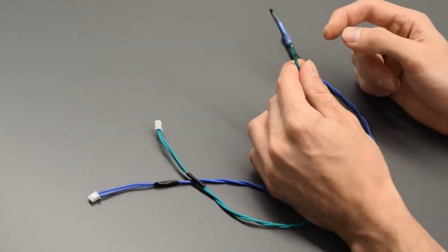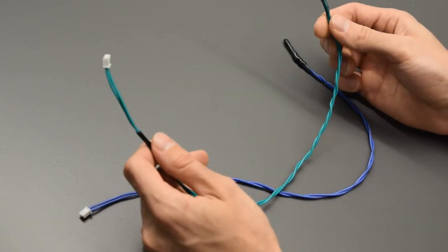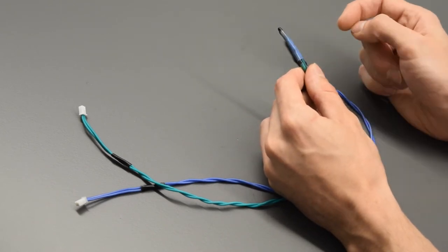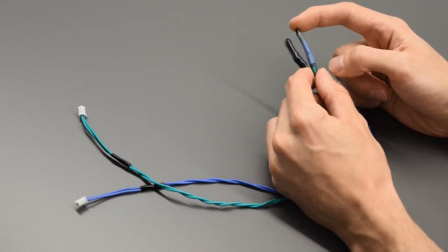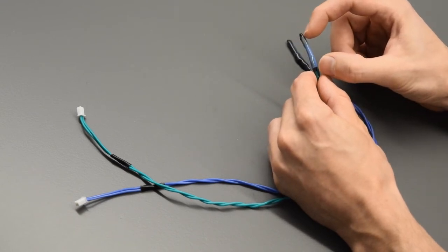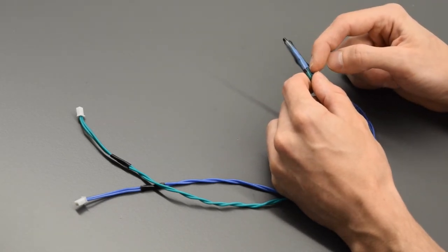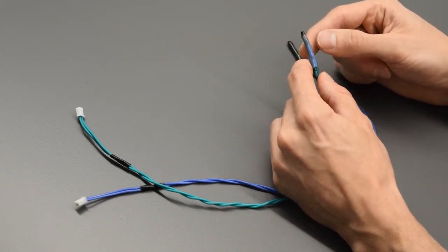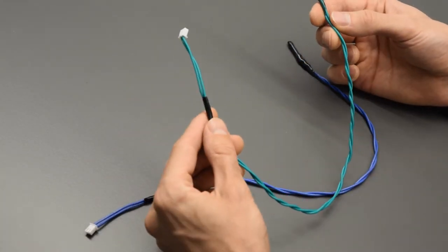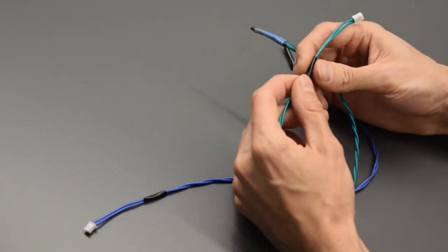So I took my thermistor, 2 wires, approximately 18 inches, and stripped the wires a little bit off each end. I have 2 pieces of heat shrink tubing on here. So again, there's a medium one and a small one. I made 1 solder connection from 1 lead of the thermistor to 1 wire, and I covered that with the small piece of heat shrink tubing, which is about that long, so it does cover the whole lead of the thermistor along with the solder joint. Then I made my second solder connection and covered everything with the medium piece of heat shrink tubing. I heated that up to shrink it down. I twisted up the wire here and I just put a piece of electrical tape. It might be a good idea to use heat shrink tubing on this instead because this is already a little bit sticky and nasty.